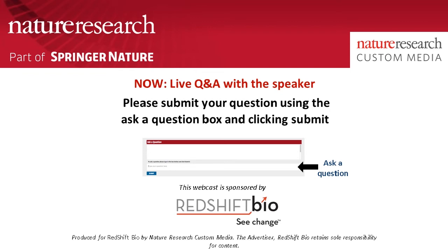Our next question asks, how easily is the upscaling of a possible assay for detecting small molecules to block alpha-sheet formation? Upscaling, I'm not sure what's meant by upscaling. In terms of doing it in a high throughput manner and scaling up an assay, you can make relatively stable alpha-sheet oligomers of A-beta, for example, and that's described in our PNAS paper from 2019.